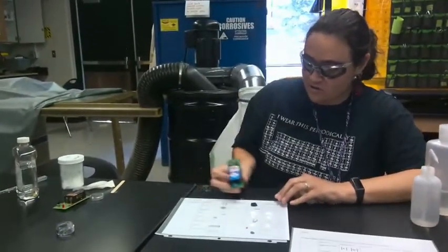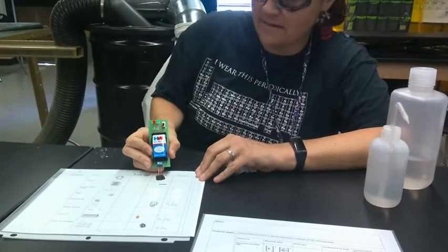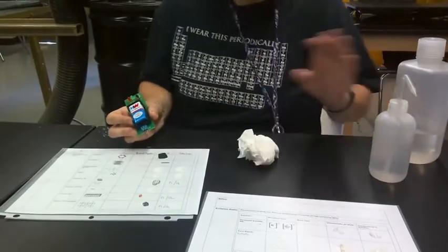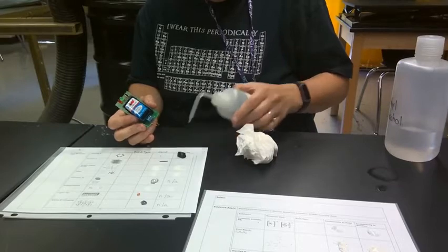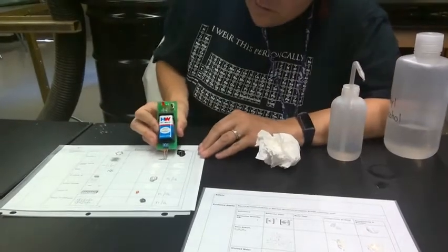We have charcoal at the top. Again, I'm just going to have you collect the data and you can go back and determine bond type at a later time. So charcoal, and charcoal is not soluble in water. We could try getting it a little wet. And then graphite.